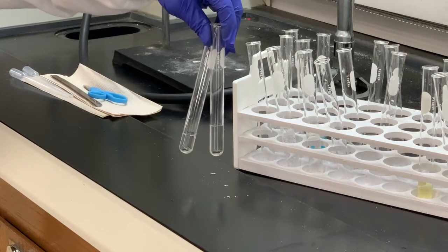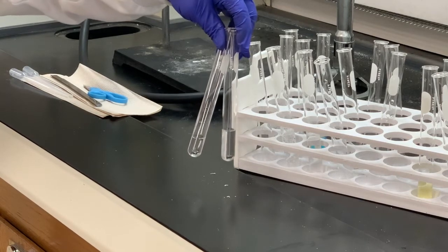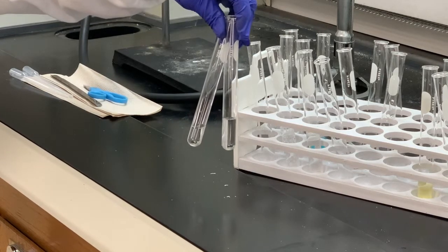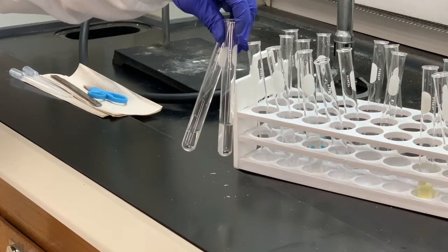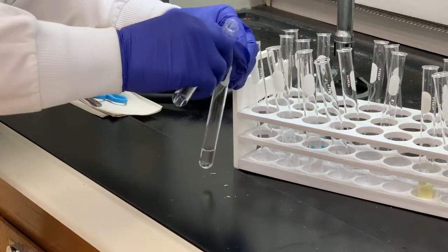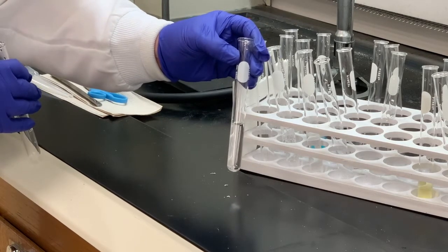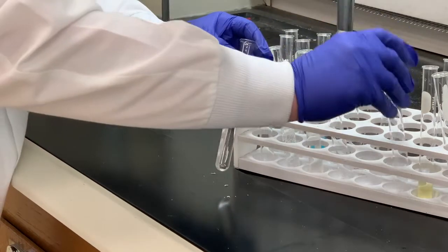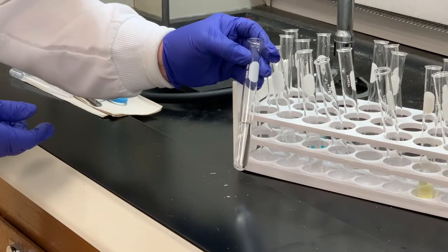Two colorless solutions. And if you think about this, think about what a double replacement reaction is. Remember, we said double replacement is cation replacing cation, essentially. So since both of these compounds have the same cation, does it seem logical there should not be a reaction? So we'll mix these two together and see what happens. Couple bubbles just from mixing, but notice there is no color change, there is no precipitate formed. I do not notice a temperature change, so we would say no change.